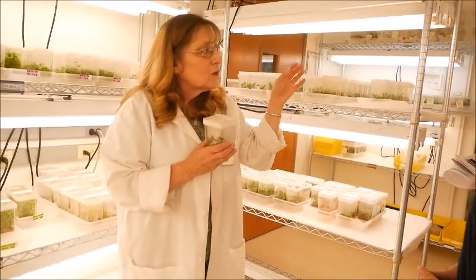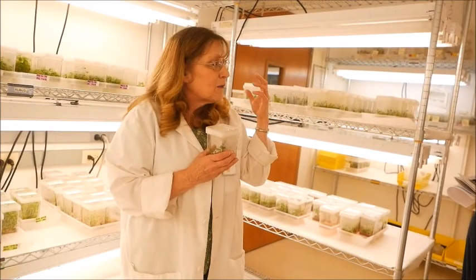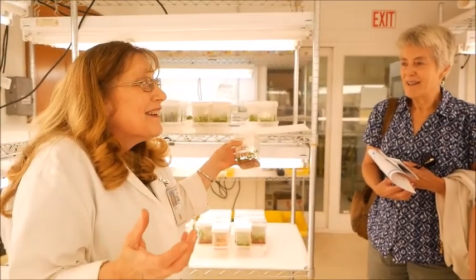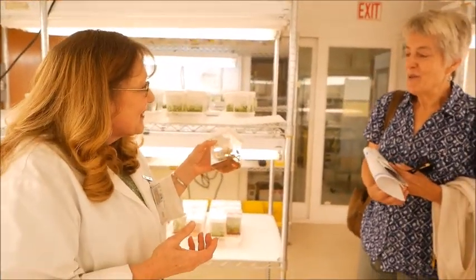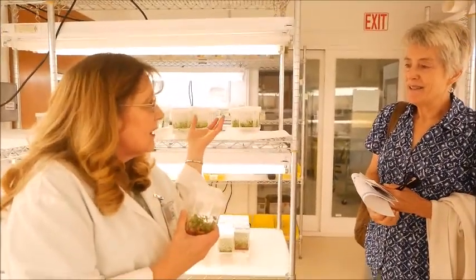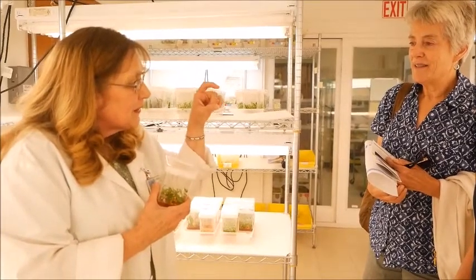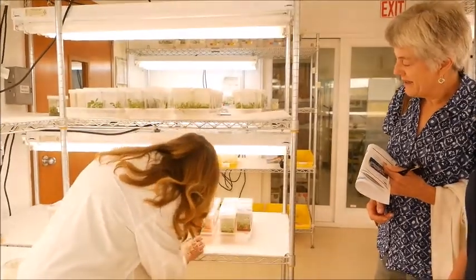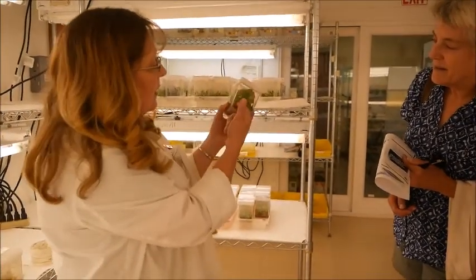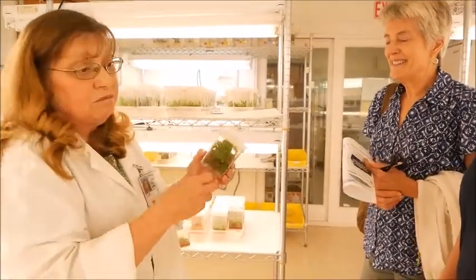That's the source for all of those orchards that have gone in — pretty much new orchards right now because they have resistance to fire blight. How many propagules do you get from one original? It just depends on how long. It goes indefinitely. So there are cycles — the first time you have one little tree, and once it gets tall enough, I can take that tall branch, cut it into three, and then the next time they grow for a month I can do it again and again.